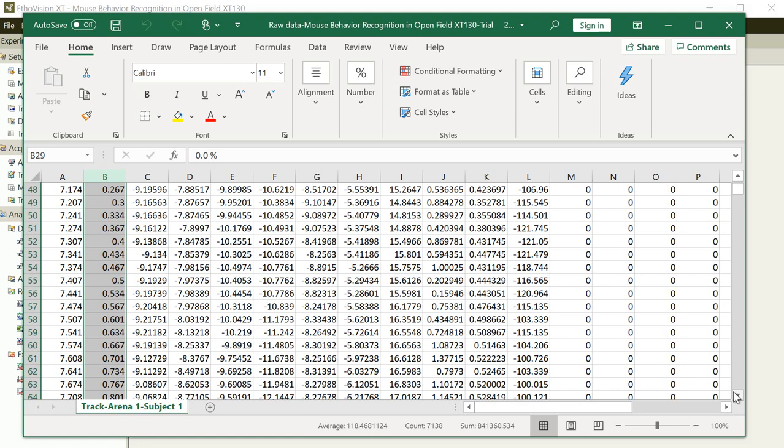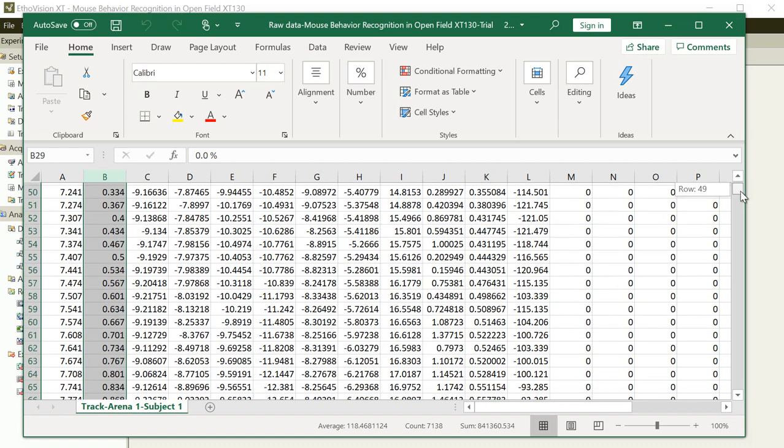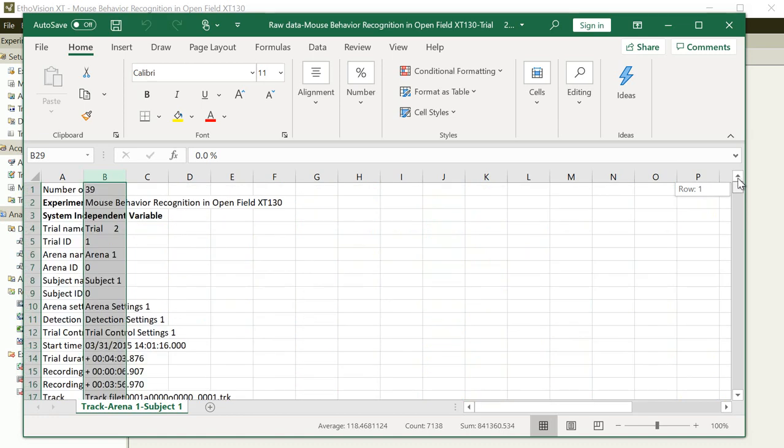But if we track 3 points, especially if we are interested in the behavior, the software needs much information about the contour, body figure, body configuration. So in that case, we have to set the maximum sampling point. This is the reason why so many points are scored in this Excel file.